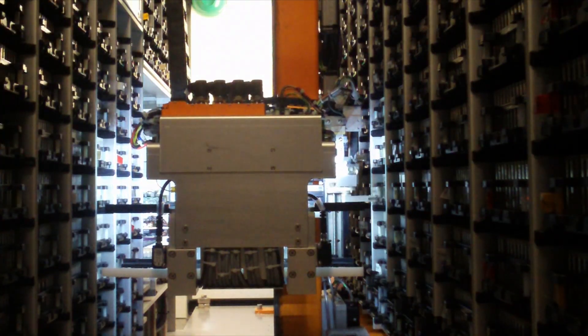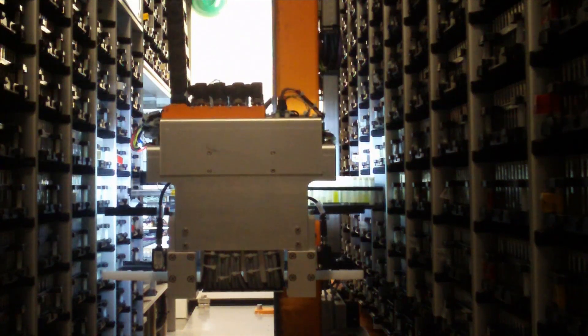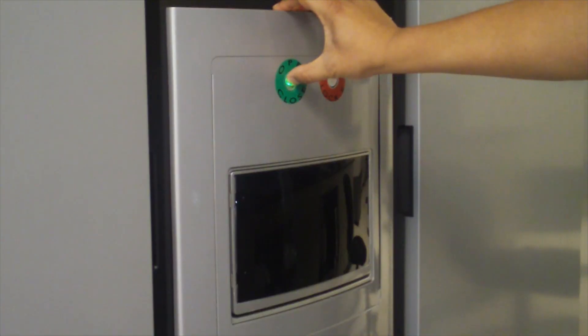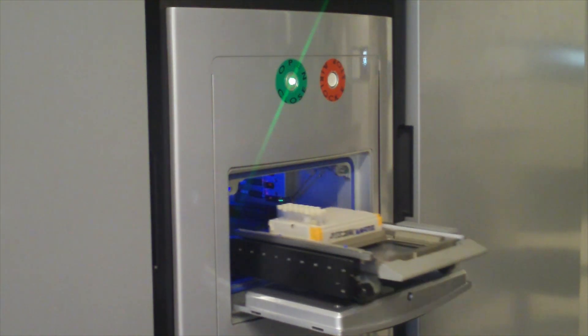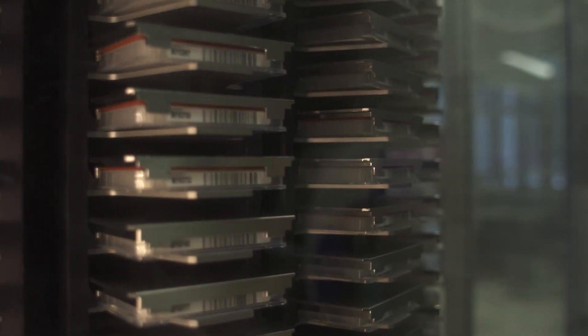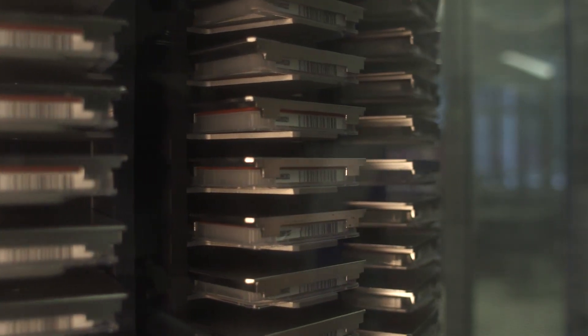The NCATS robotic system enables researchers to routinely test a library of 450,000 chemical compounds. Part of that library consists of the NCATS pharmaceutical collection, which includes most of the approved and investigational drugs from around the world.